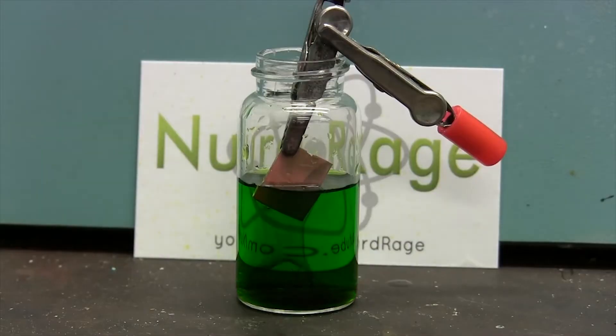Hi everybody, my name is Motwana. I want to show you how to make copper chloride. There are different ways that you can prepare copper chloride, so let's get started.